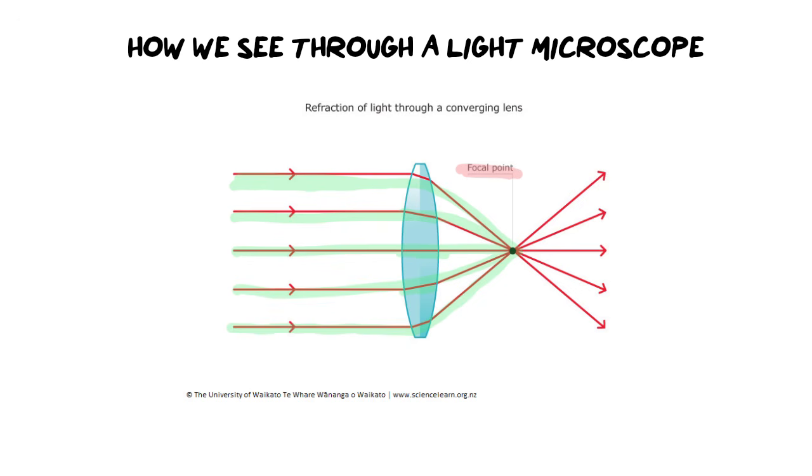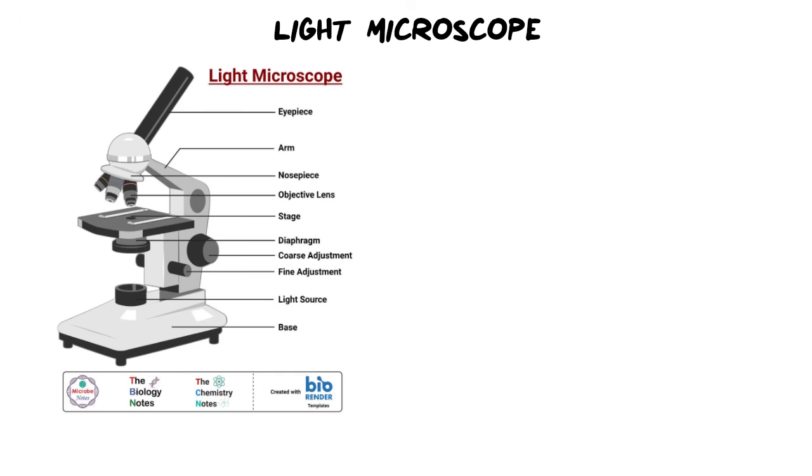Because what it's doing is it is collecting light from this really large surface area over here, and it's collecting it down to this very small point, which means that what you're able to do is, if you think about it the other way, something that's very small, you can also make it really big. Okay, so think about this lens just pointing the other way. We can make this really, really big, and lenses help us do that by magnifying things. And you might have seen this with a magnifying glass with newspaper print and how I can make it a lot bigger.